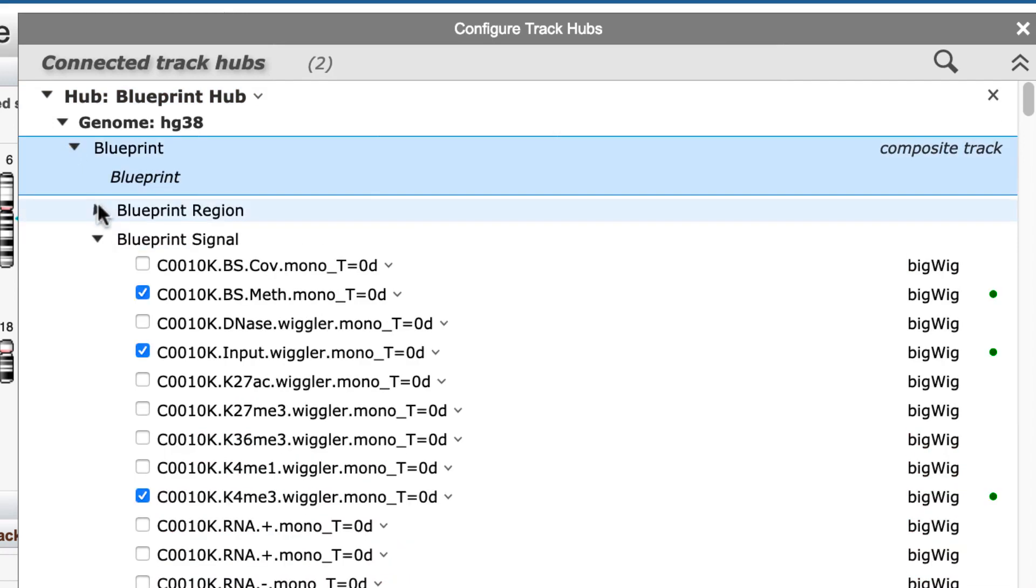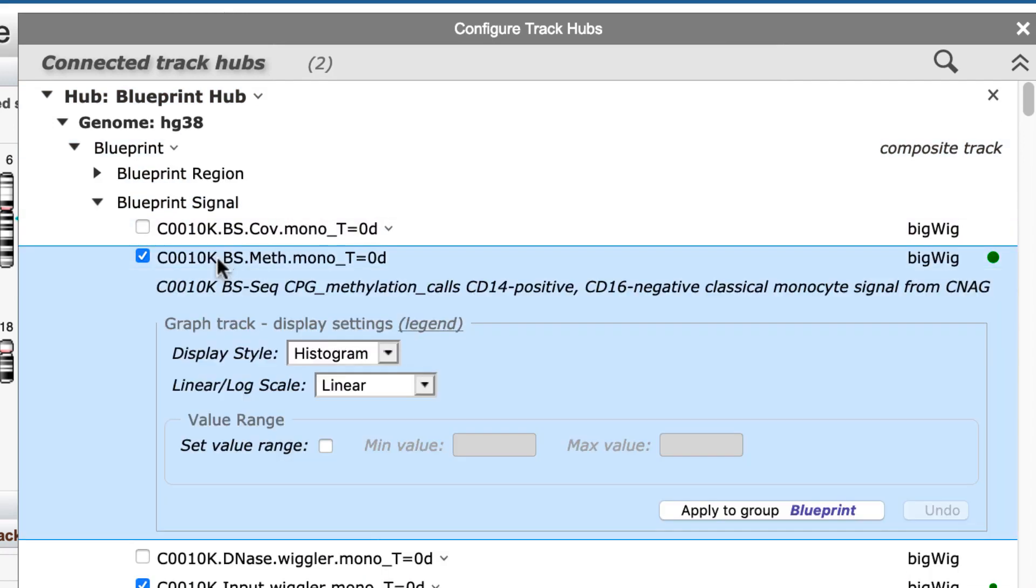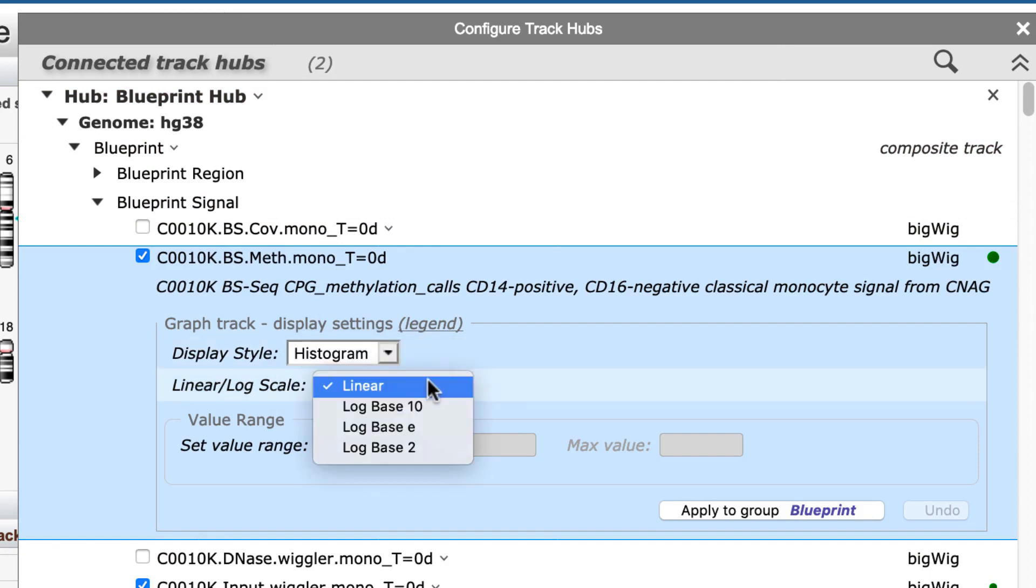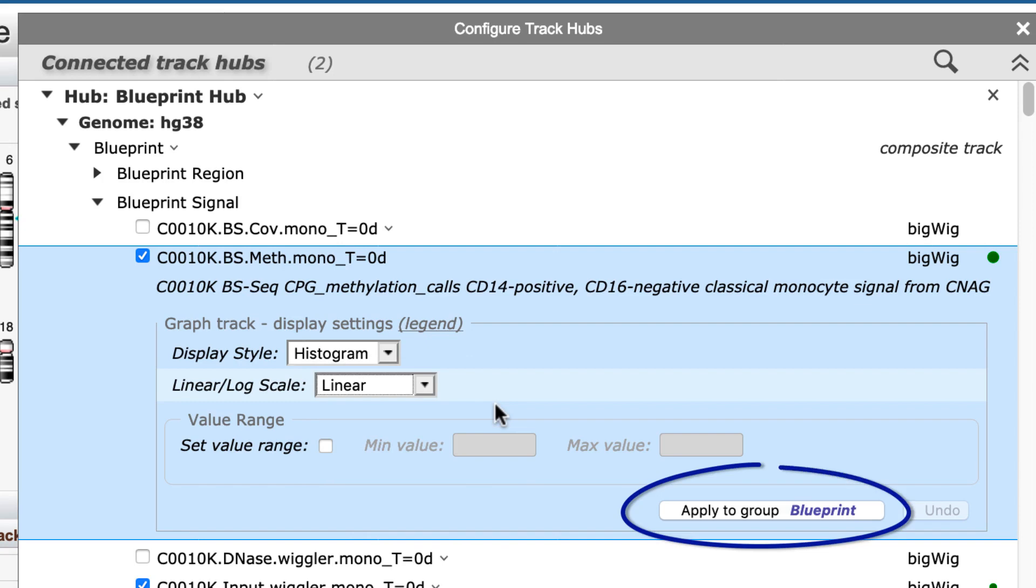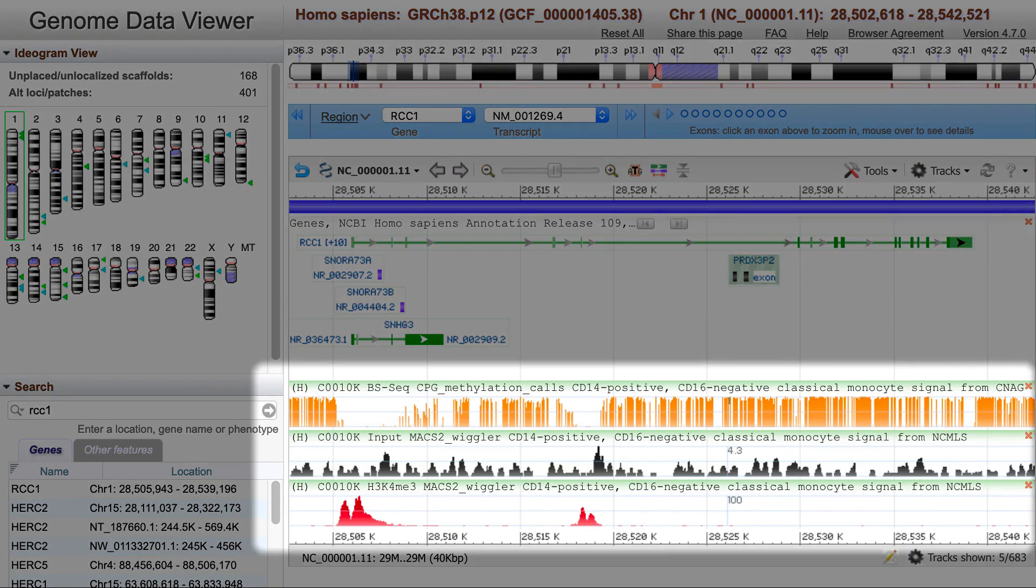I've already selected a few of the bigwig tracks, but notice that you can adjust some track settings right here in this hub configuration menu, including an option to apply these settings to the entire group. I'll hit Configure, and these tracks load in the viewer.